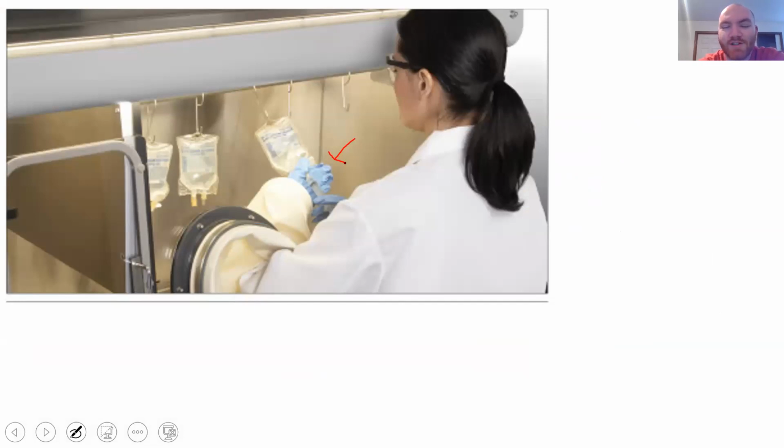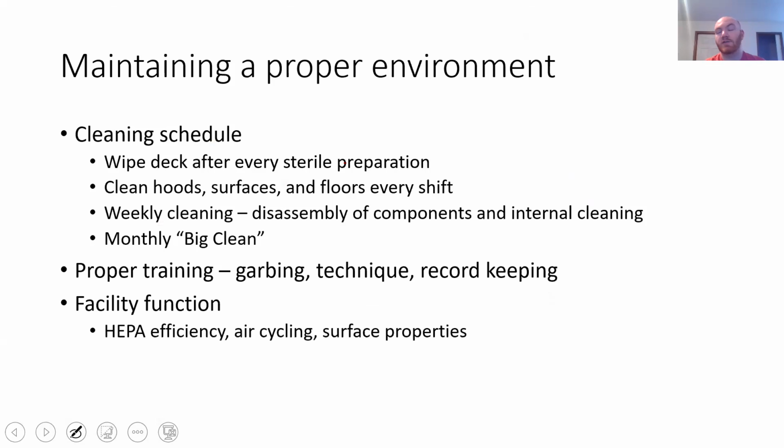Another thing about these is you are sharing these sleeves with everybody else in the pharmacy. Long sleeves are technically not allowed, but you have these arm socks almost that you can put on. They're supposed to keep all the oil and gunk from getting into the sleeves. In my experience and practice, these do not get used like they're supposed to be, because some people just go on without them. These are also generally cheaper than maintaining an actual room, so you'll see them a lot in small locations.